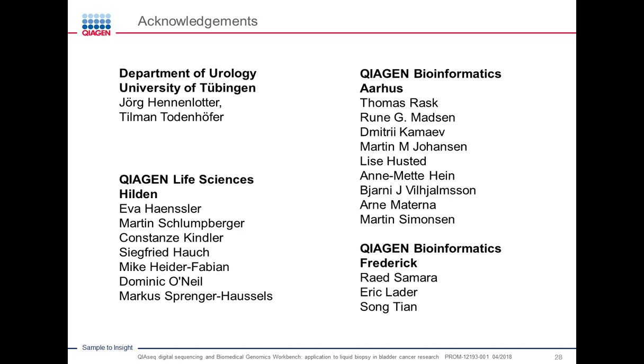What level of coverage is recommended to achieve the maximum accuracy? So this is definitely connected to what I was mentioning before, and as you have seen in our performance data, we show for some of the most difficult applications the highest accuracy level when we have a coverage above 2,500x UMI. What is very important to keep in mind is that this coverage will be the coverage after you created a consensus read from all reads carrying the same barcode in the UMI technology.